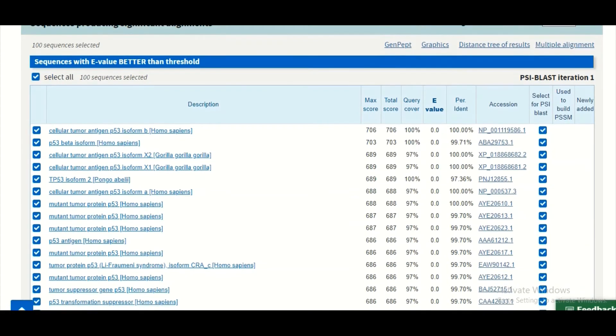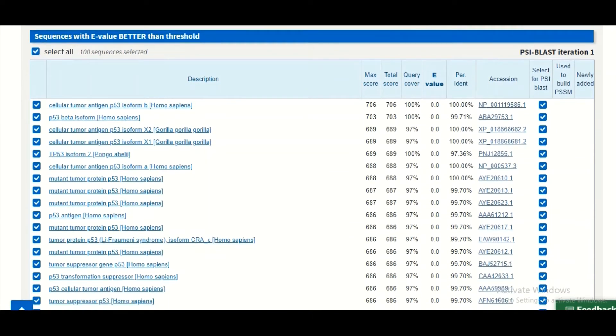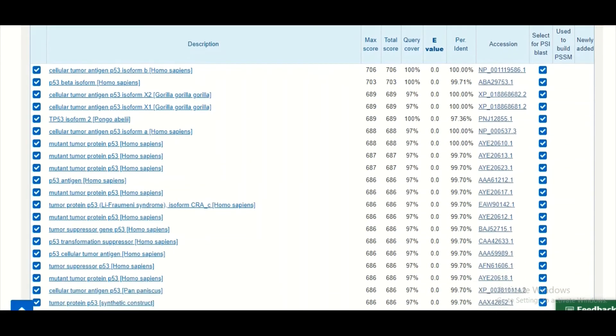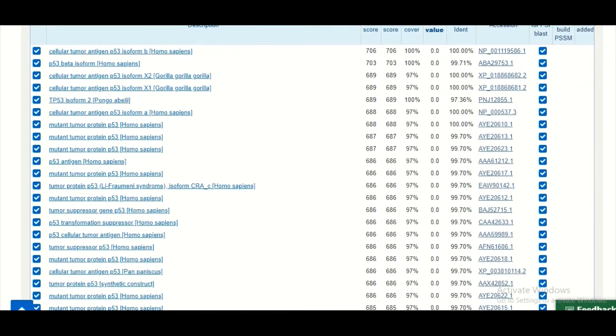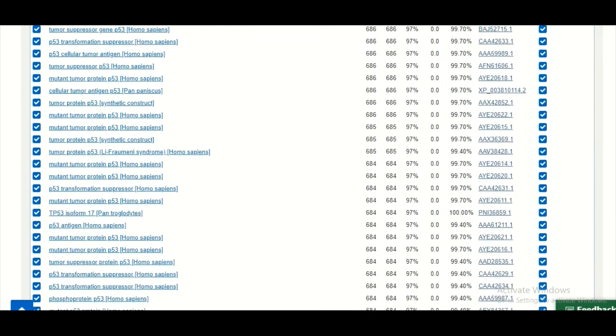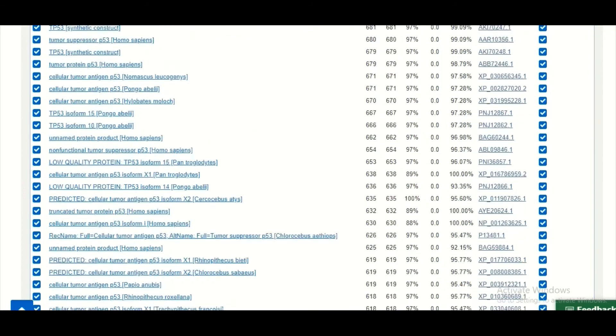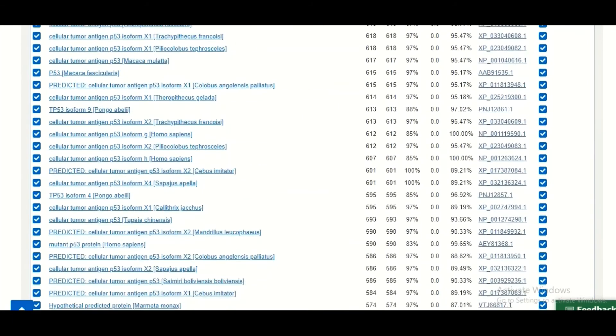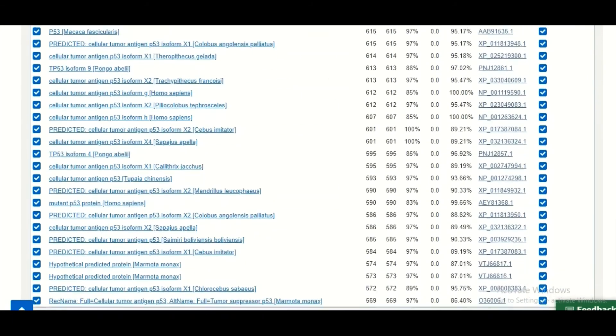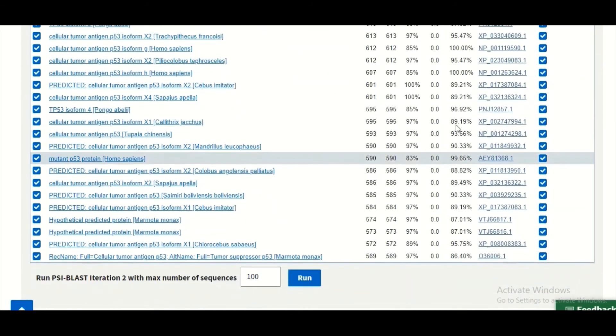Now let us assume for a moment that there are some sequences which are true positives, which are the true homologs, that are still missing in the first round. So what we will do is we will select all of them as you can see here, and at the bottom we will click on this run button.